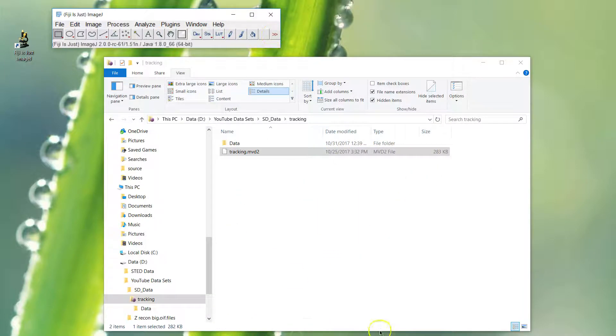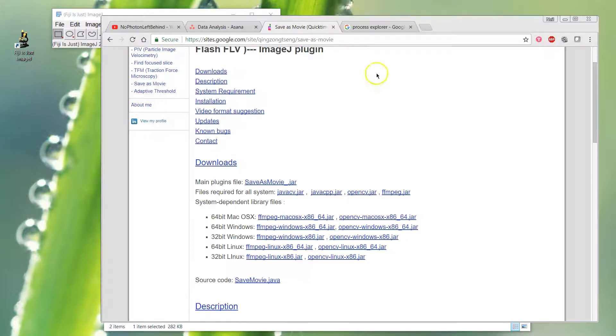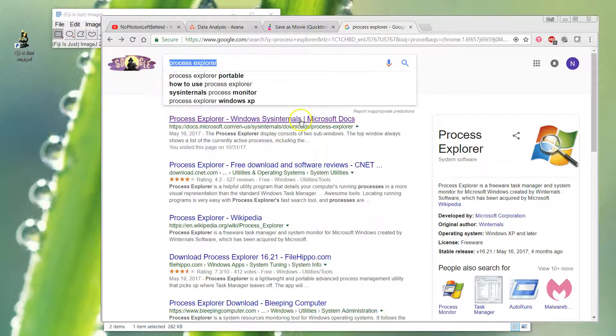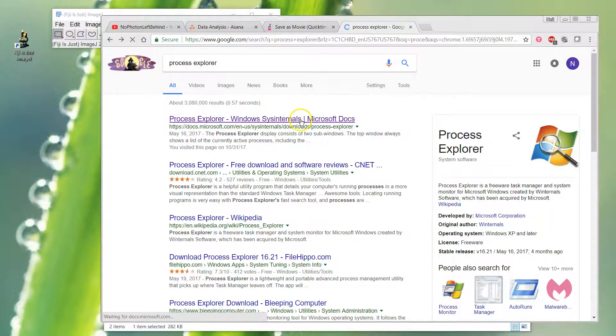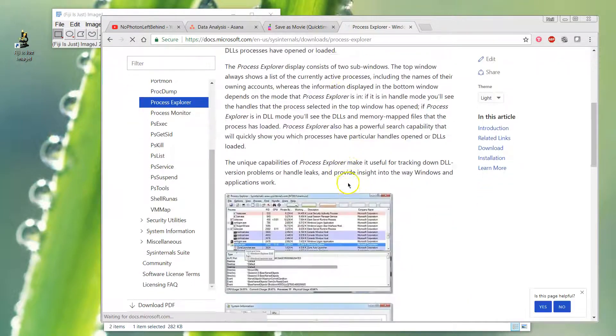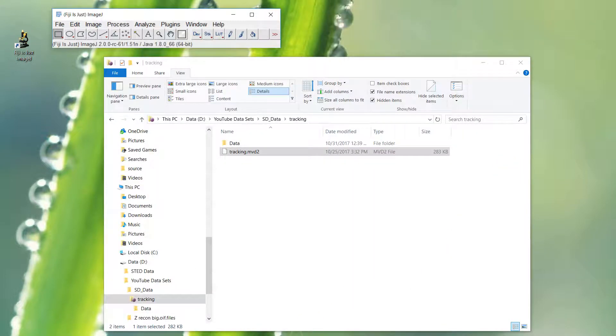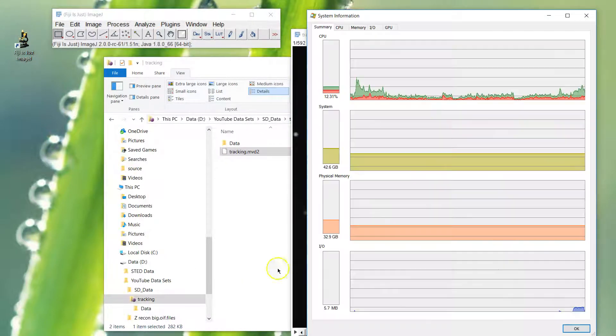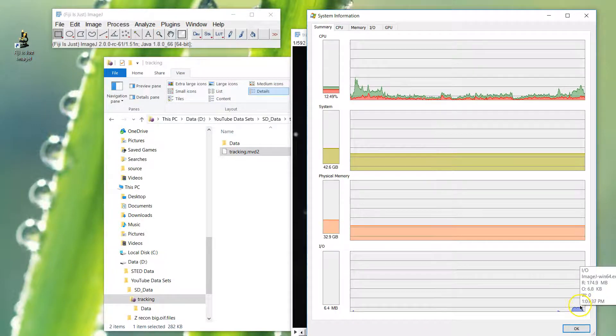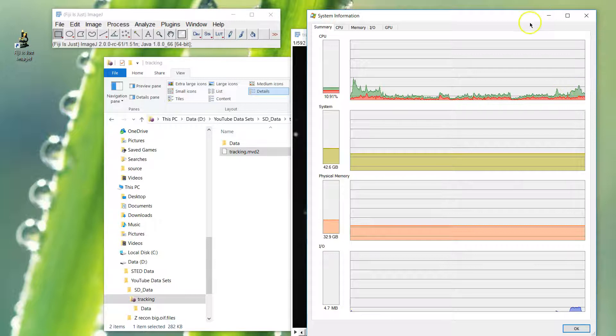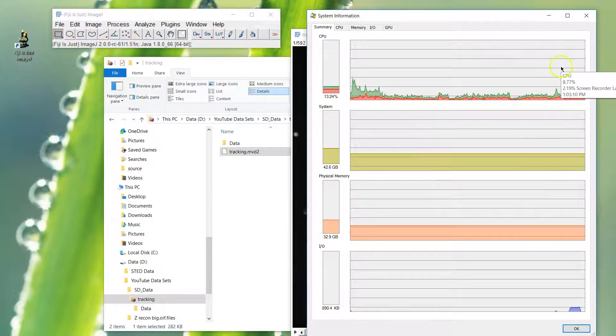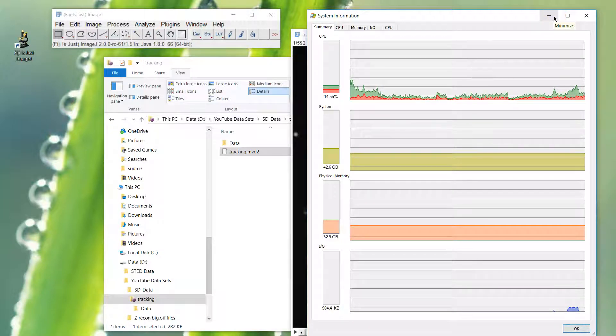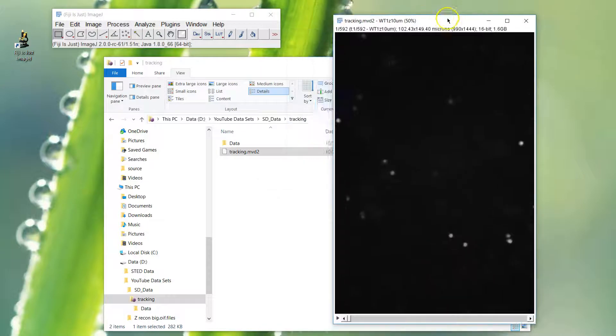It takes a little while to come in. It doesn't really give you any warning or update on what's going on. As a side note, if you Google Process Explorer - it's the first hit - I recommend downloading this. It will give you a breakdown of what's going on with your computer, so you can see what's happening at every given point. You can follow what's happening with a machine, especially with software that doesn't give you a complete heads up about stuff.